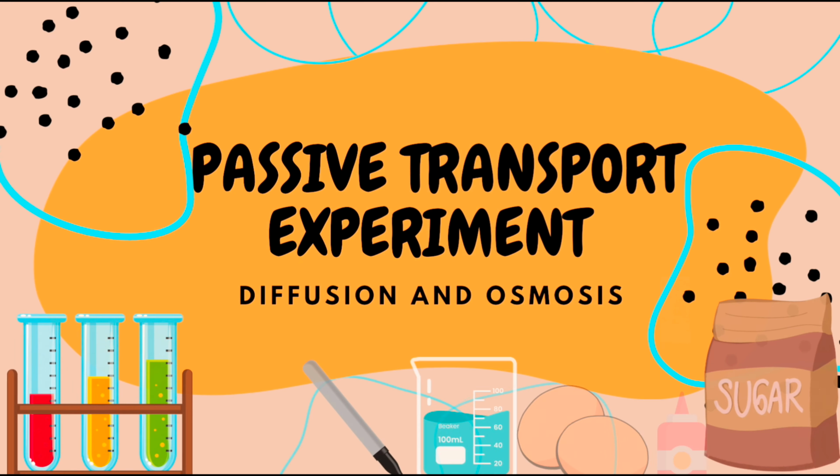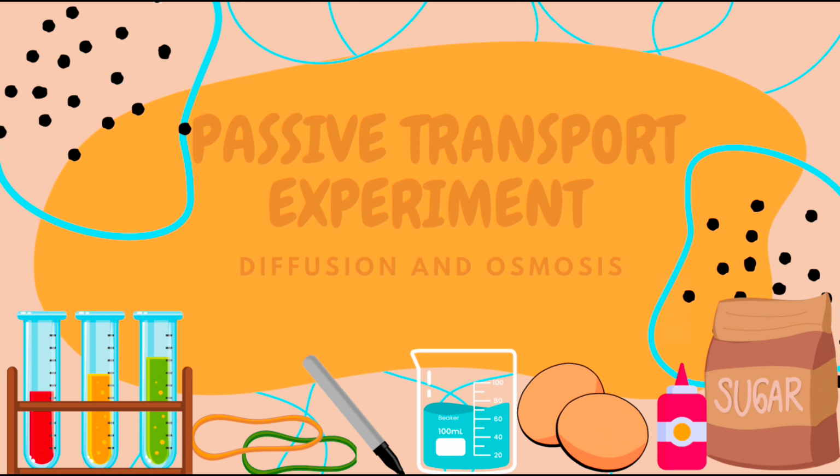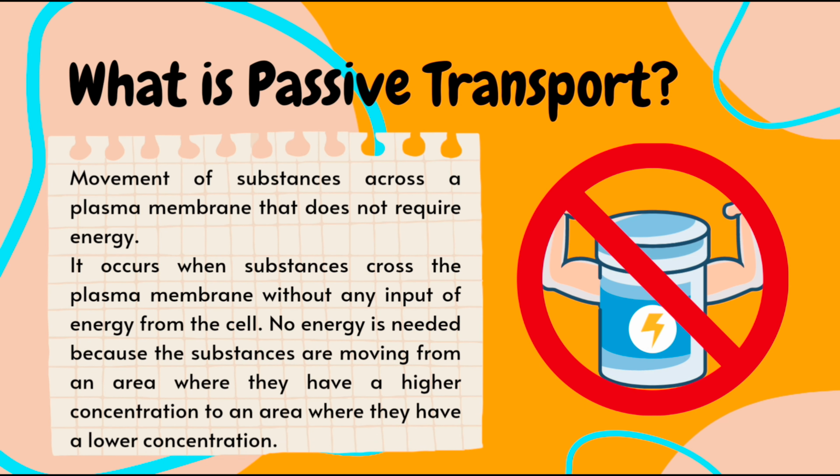Good day everyone. In this video, I will be doing the passive transport experiment, which includes diffusion and osmosis. Before I get into the experiment, let us first define what is a passive transport.